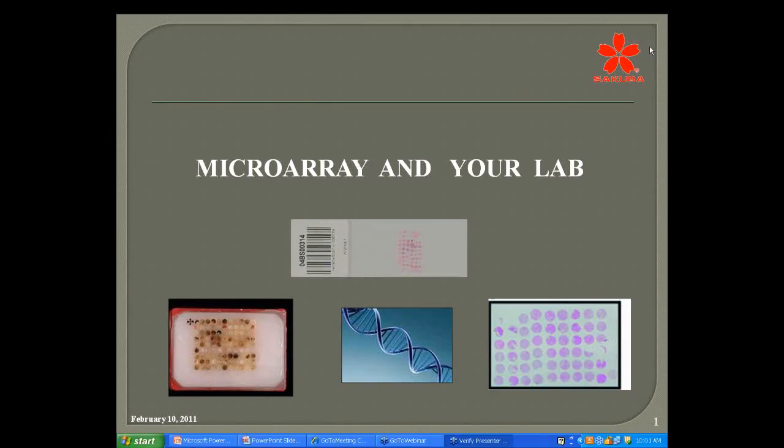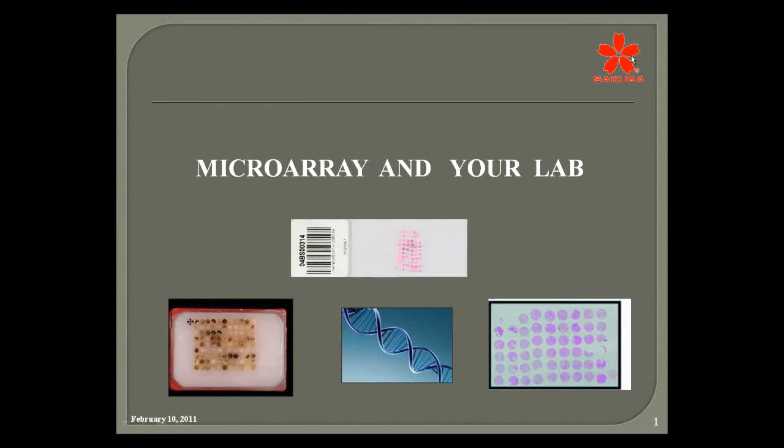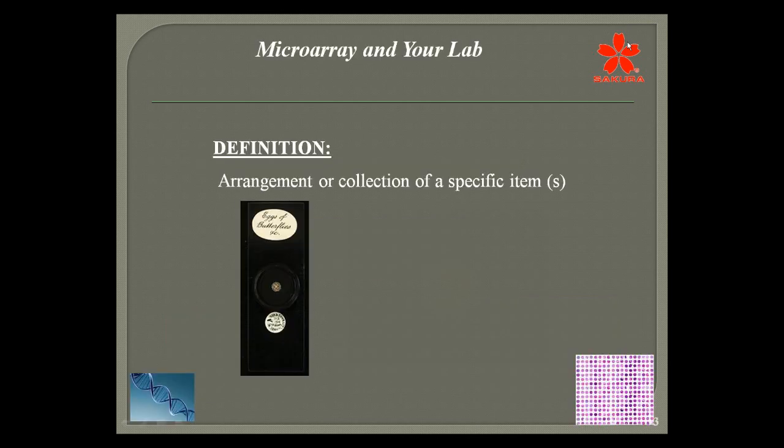Well, thank you and welcome, and we hope today that we can share with you some information about TMAs. Some of you may be doing those, and some may not. Some may wish to do them. They are a lot of fun. They are a lot of work, primarily for things that you do in the very beginning, or certainly if you're using them for controls or validation, they're a lot of work to do up front, but it makes everything that you do after that so much better.